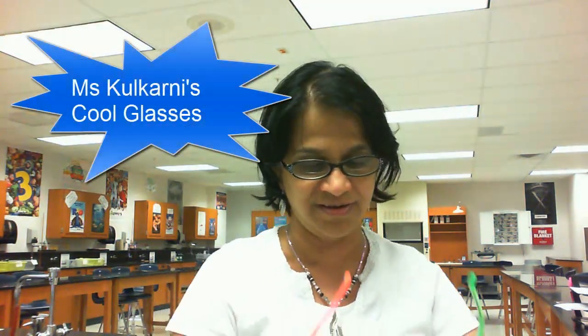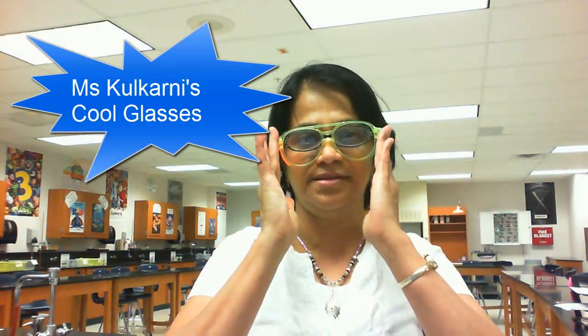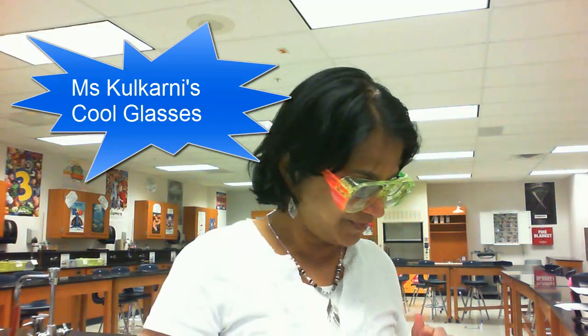Hi kids, Miss Kulkarni here. Today we are going to talk about physical and chemical changes and how the physical properties of compounds get changed when there is a chemical reaction. And there are some key factors which are indicators that will tell us if a chemical change took place or not. So let's begin, and I am going to put on my cool glasses, safety goggles here.